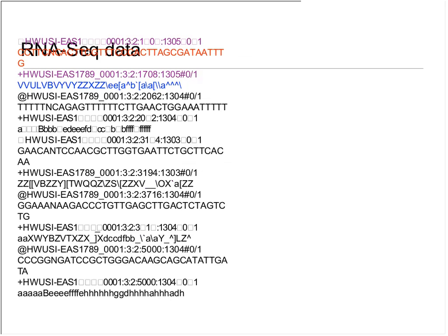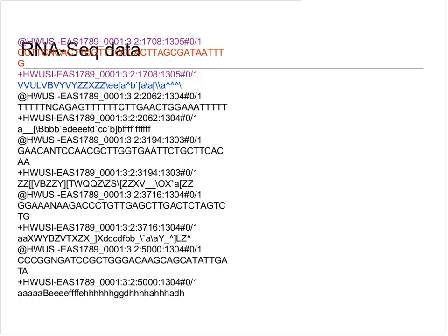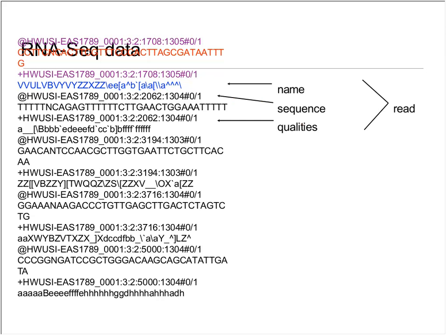Okay, I'm sorry. So this slide is also a little bit garbled. This was supposed to show a piece of an actual data file. It's a FASTQ file that contains a set of reads from a single RNA-Seq experiment. And in these files, each read is represented by a number of lines that give you the sequence. There's a name identifier, and there's also a quality score string, which is basically the sequencer's way of telling you its confidence in the base calls that it made at each position within each read. And each lane of, say, Illumina technology might give you 20 to 200 million reads in these files.